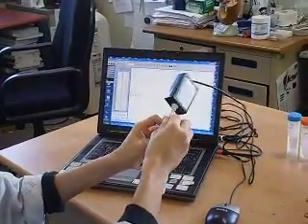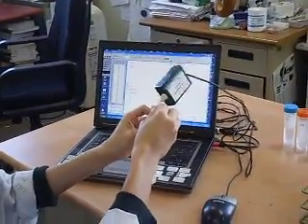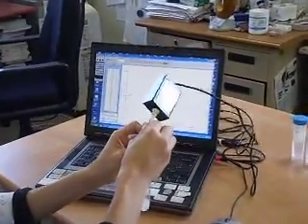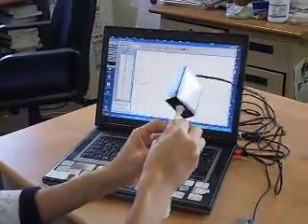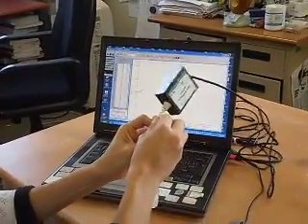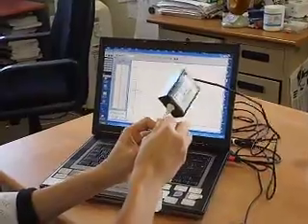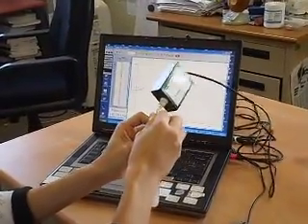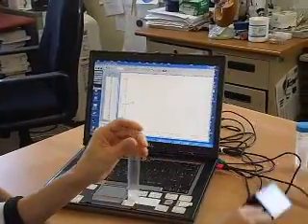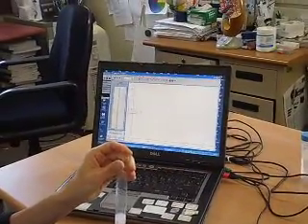At a lower concentration, of course, the rate of hydrogen gas production is lower, and is represented by the steepness, the gradient. I'm going to show you now how we're going to measure the gradient. So we're going to stop the reaction at 90 seconds. At 90 seconds, I'm going to release it, and the pressure will drop immediately. 90 seconds, drops. So I click on stop.